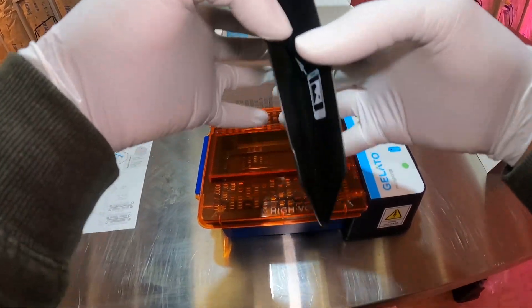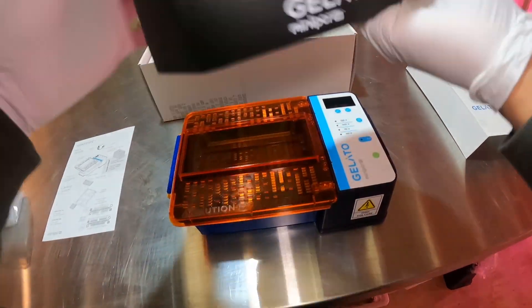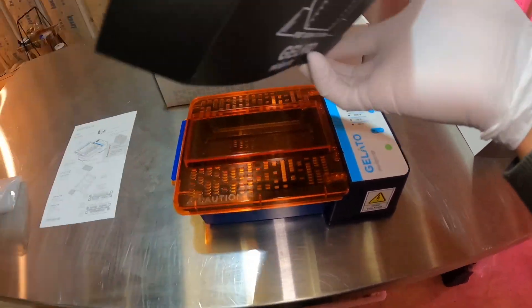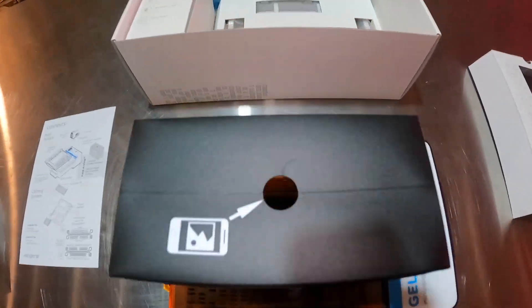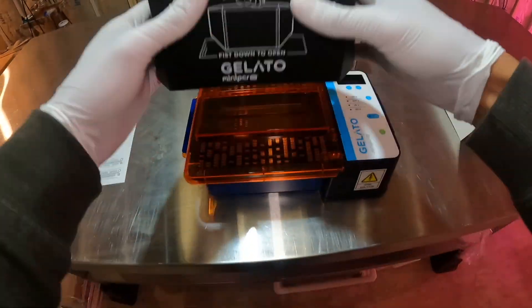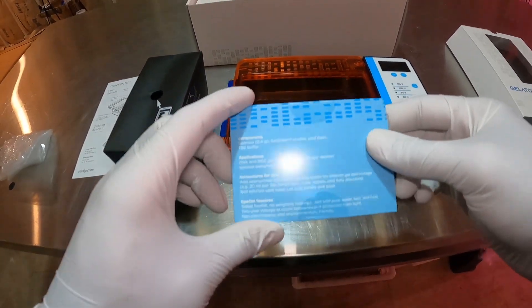So we got the Gelato System and then we have this little viewer that we put on top whenever we turn the light on to view our bands in the gel. I really like this because I can put my phone right up to it and take really nice pictures whenever it's illuminated.